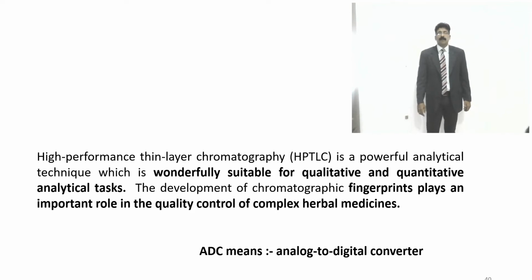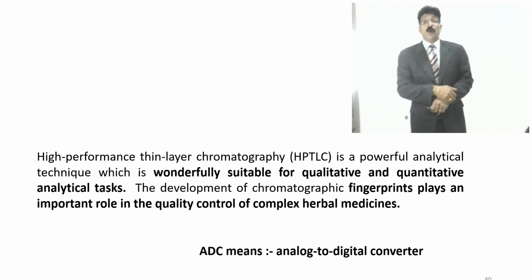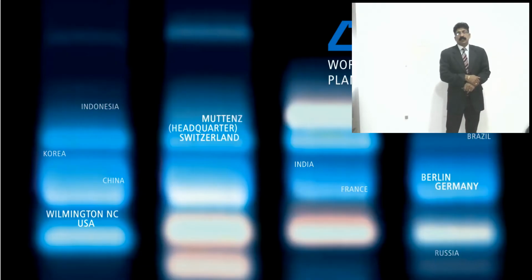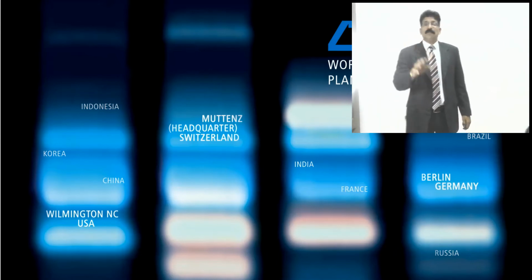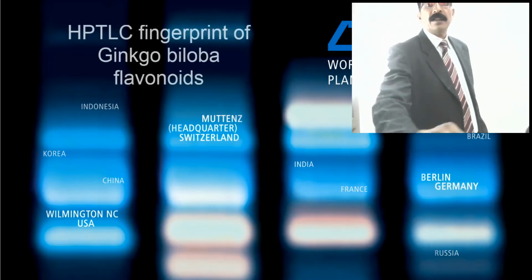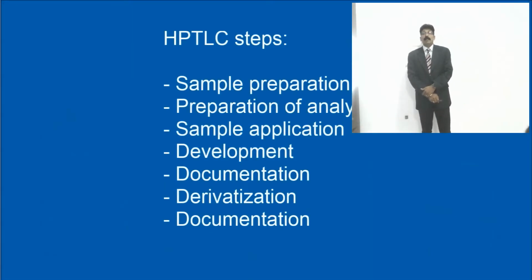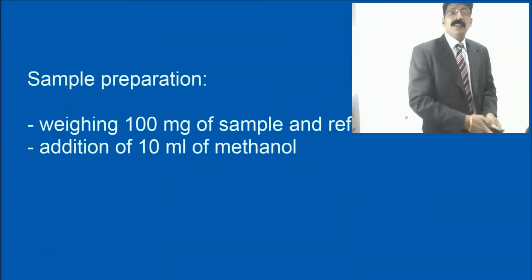The development of chromatographic fingerprints plays an important role in the quality control of complex herbal medicine. And here there is a video which can give you some idea. I have already shown this in another topic, specifically in herbal drug technology. Here we can see the fingerprint for Ginkgo biloba, the sample preparation for analysis, and sample application.